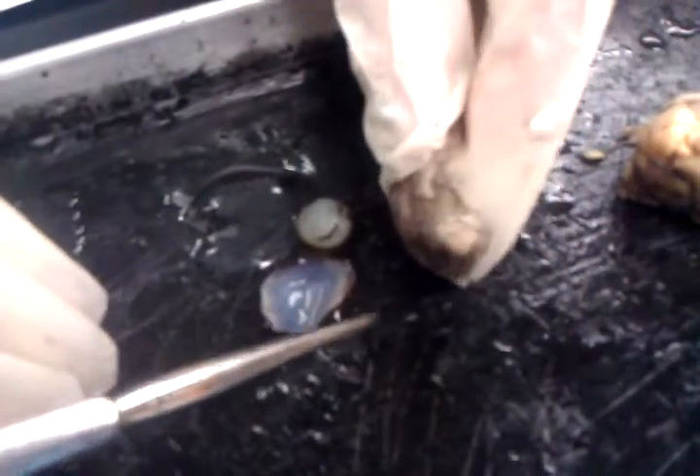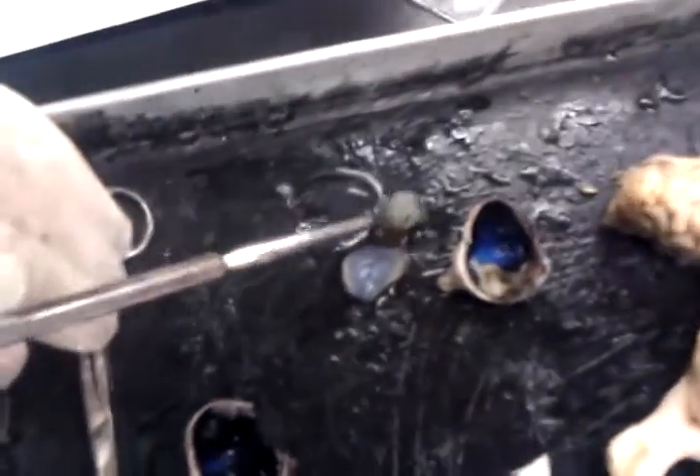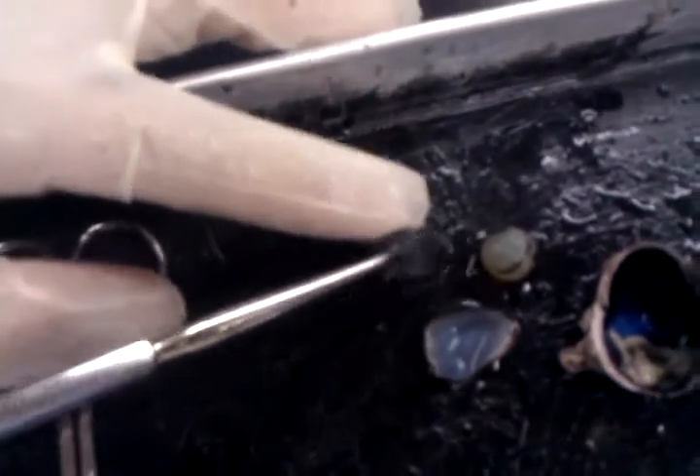The optic nerve is right here — this back part. This is the lens. And this body part right here, this was the vitreous humor.